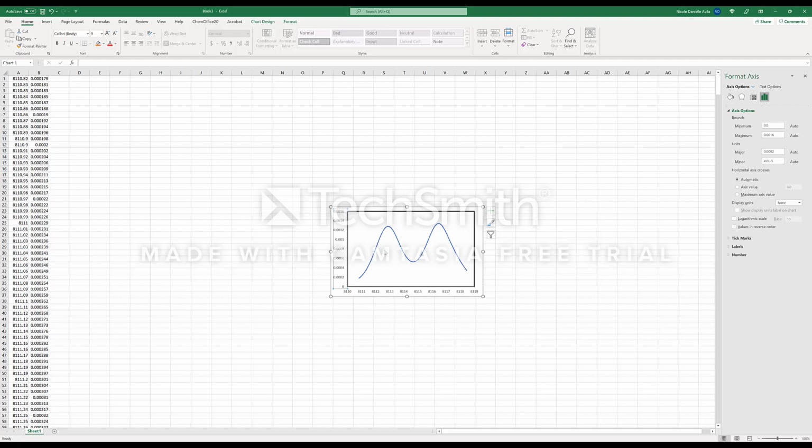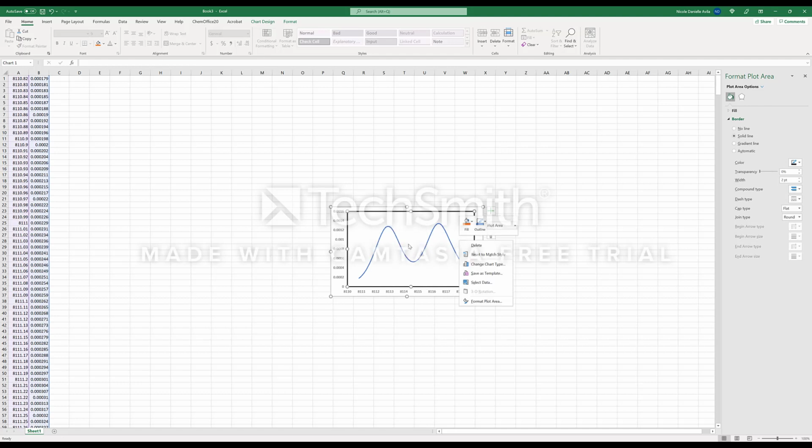And then for these, I'm going to keep them the same. I sort of really like it like that. For some reason in Excel, it doesn't ever make it the color that I want. So you want to go ahead and change that, especially for these. You can do the same thing with this. Let's say you want a different color. For my posters, I usually like to match the XES Spectra's color to the figure. So for my outline, I usually leave it as blue, but for the sake of this tutorial, I'm going to change it. And I'm going to do that by using the drop down, clicking series 1, then clicking black.